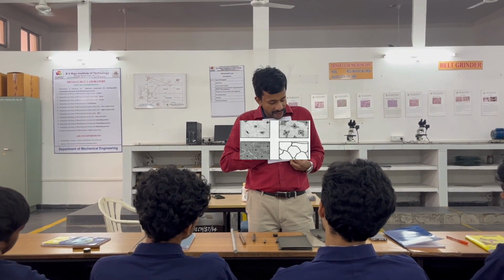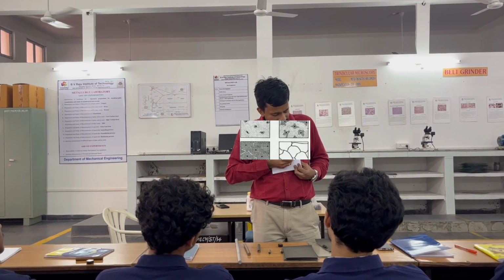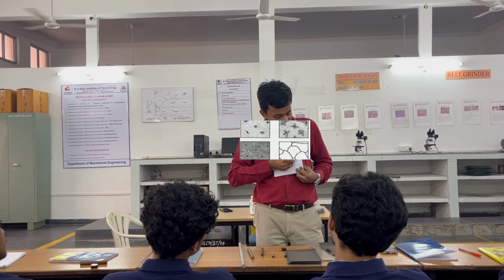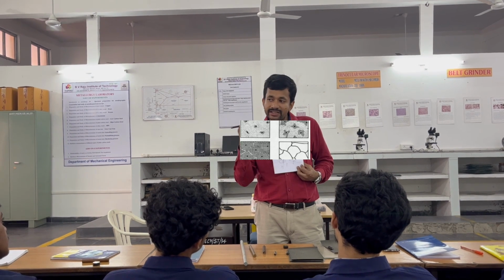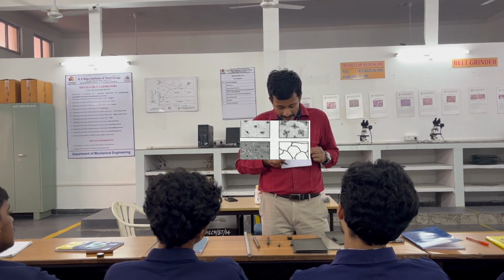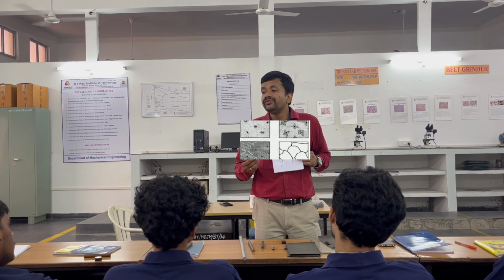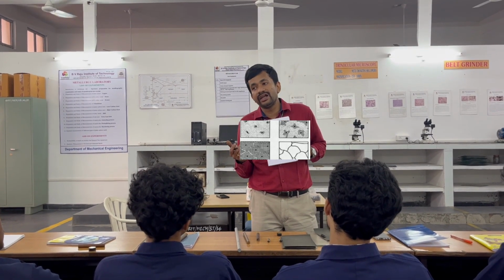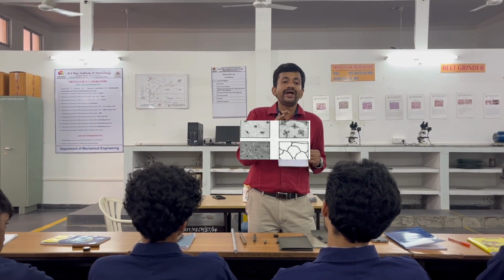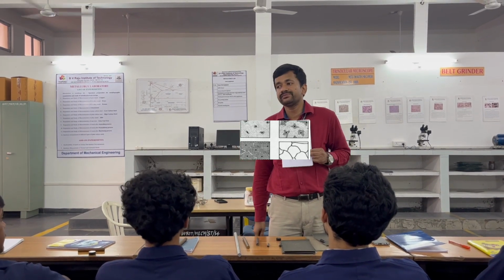But whenever you expose it under the microscope, there will be a reaction which is very small, but even then the light will go here and reflect here, and it comes back on the other side, making it a darker portion. And that is the reason why all the grain boundaries where the reaction occurred will be darker in color. The rest will be bright in color, and that is what you can identify as a microstructure representing the grains and grain boundaries.